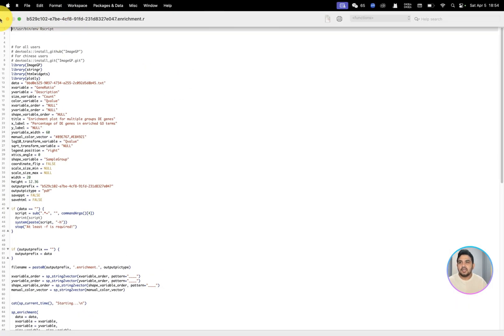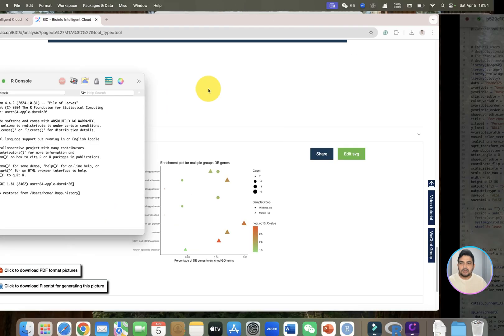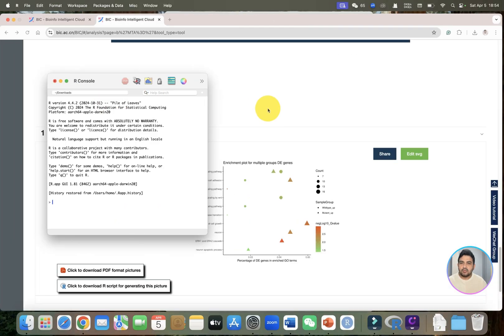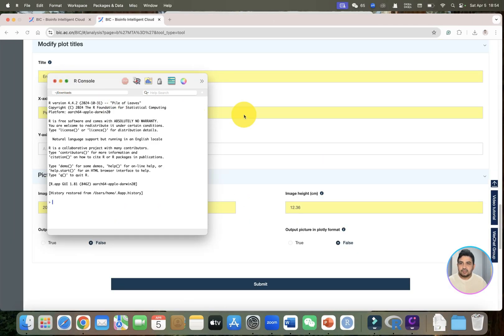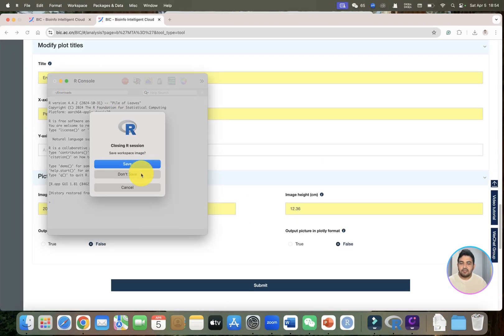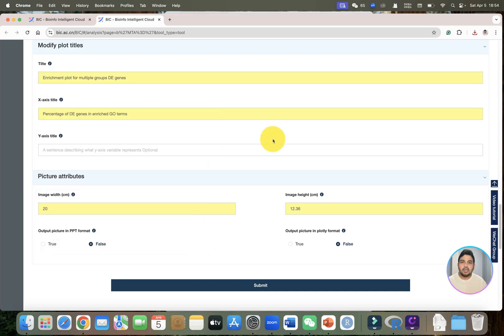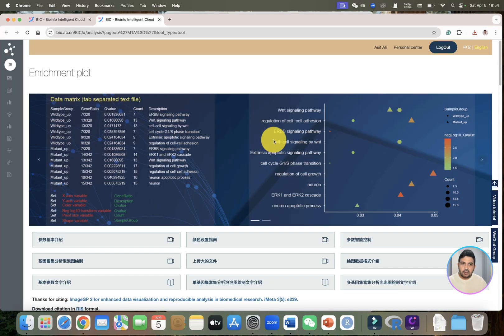I think this tool is going to be helpful for all the students. I will be exploring different plots, so stay tuned.